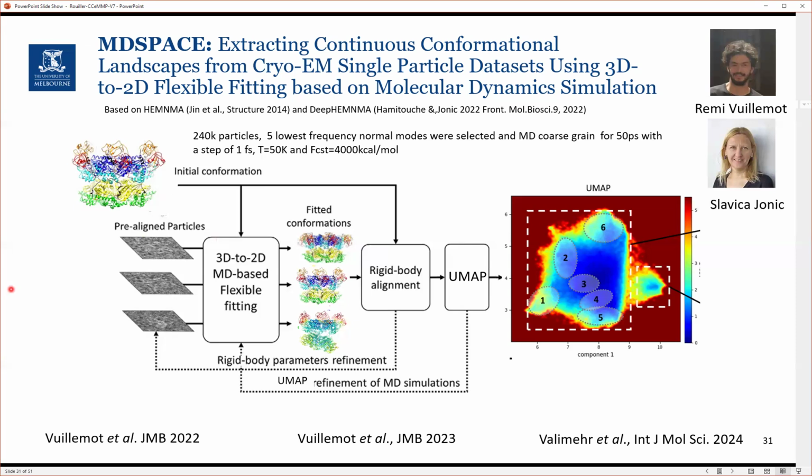And also for some of you who may be interested, fitting is not limited to 2D images, as we showed using another software, MD Tomo, where we can look at each individual subtomogram and do the fitting within each subtomogram, without averaging different volumes together. Because we're only looking at densities for one particle at a time, in a 2D projection or in a subtomogram little box, we can really understand the conformational heterogeneity and describe all the possible conformations adopted by a protein.